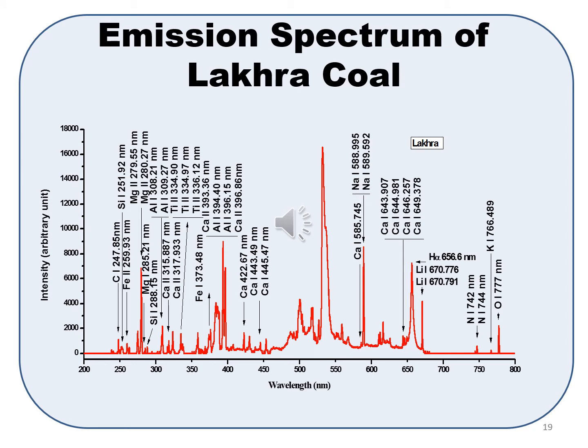This is the emission spectrum of the Lakhra coal, and you can see how many lines and how many elements there are.